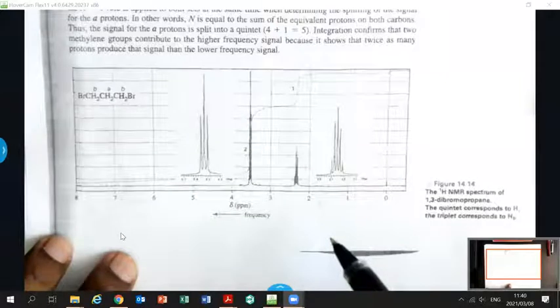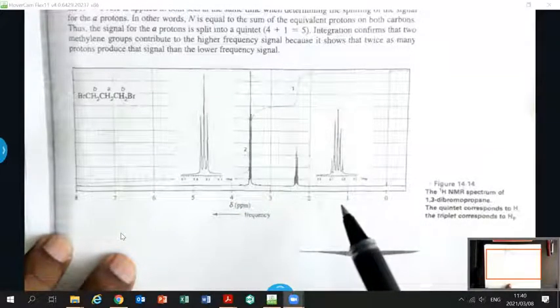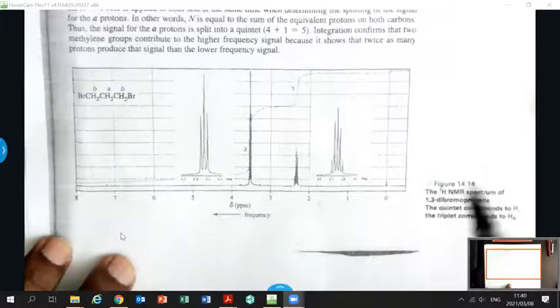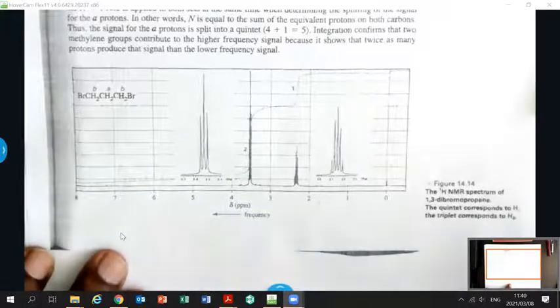So at this stage, at second year in your career, you can actually take simple molecules like this and work out a structure, right? My master's and PhD students do complex molecules, 20, 30 carbons long, and 20, 30 carbons in a ring. Basically, we work on heterocyclic molecules, but it's much more complex than this. But at second year level, you can do something like this. So let's look at this particular molecule.